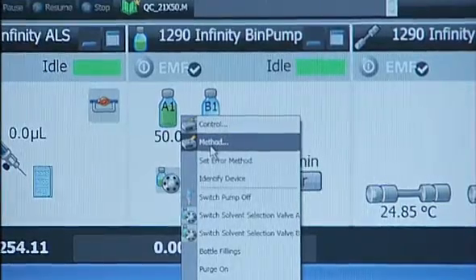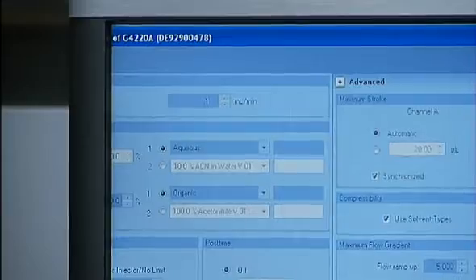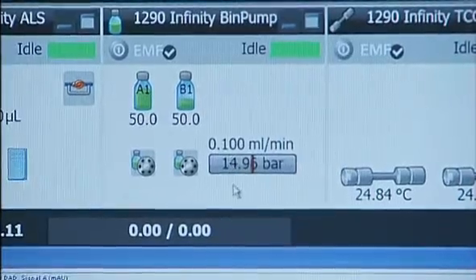So you want to start out with a fairly low flow rate, and as you see the pressure go down from the particles dislodging from the frit, then you increase the flow rate and flush the remaining particles at a higher flow rate. Note that sometimes particles can get lodged within the porosity of the frit. In other words, deep into the frit, and it's not easy to dislodge them. In that case, you probably won't be able to get the pressure down by this operation. Most likely, the column will have to be discarded and a new column put in your instrument.